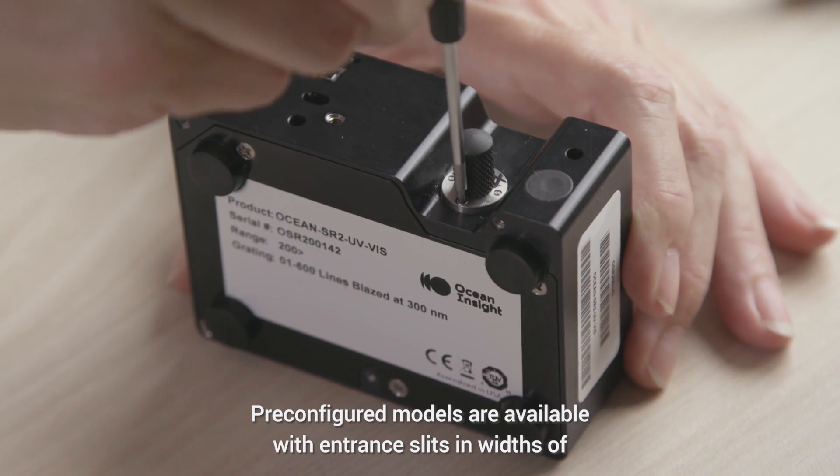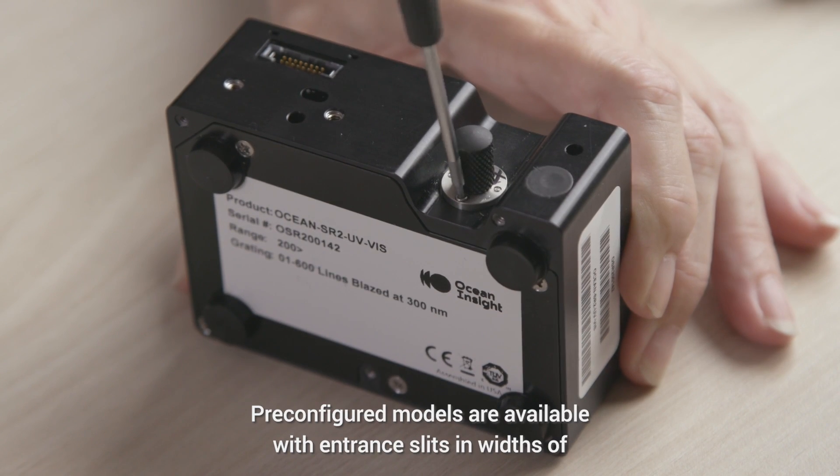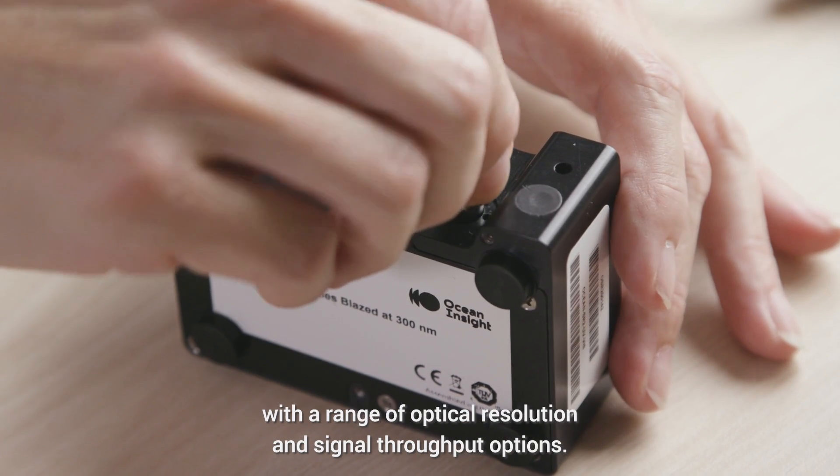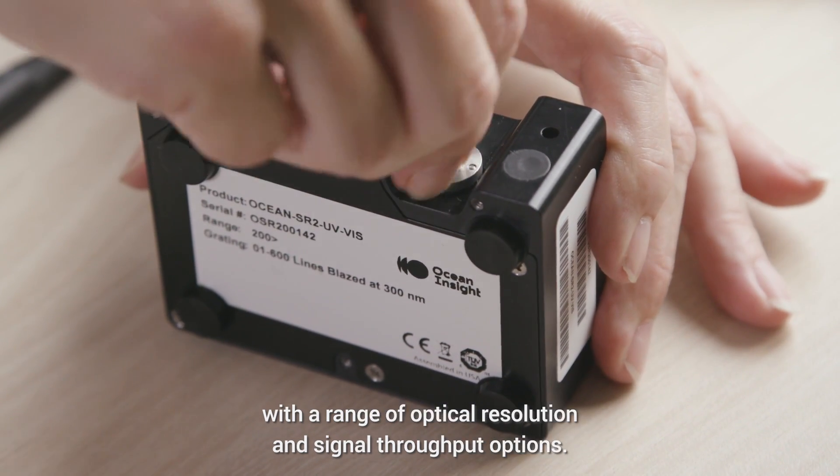Pre-configured models are available with entrance slits in widths of 5 micron to 200 micron, providing users with a range of optical resolution and signal throughput options.